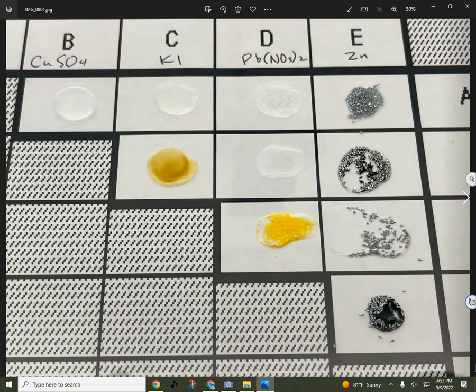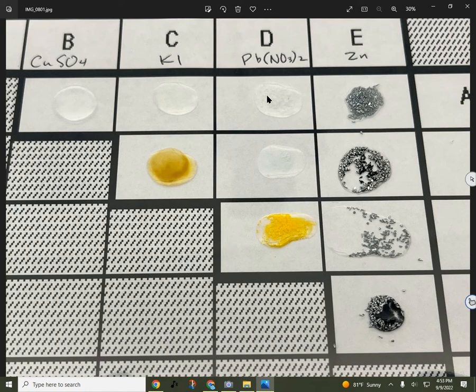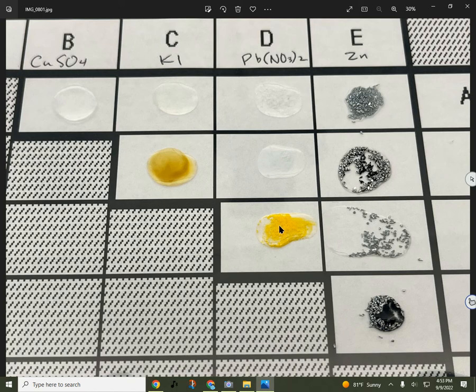Here are the photographs I took of the reactions. Here's the whole thing. You can't really see much happening here, but you can make out the precipitates here a little bit. There are bubbles forming here but it's hard to see in this view. Definitely some color change here. You can see that the zinc has turned black where the pieces have sunk, and then you've got yellow precipitates, and not much happening here.